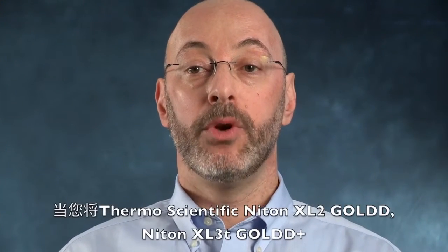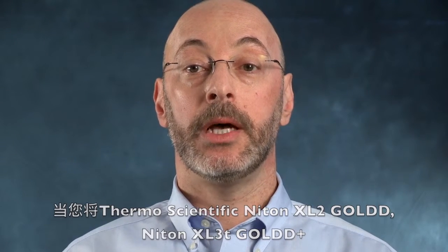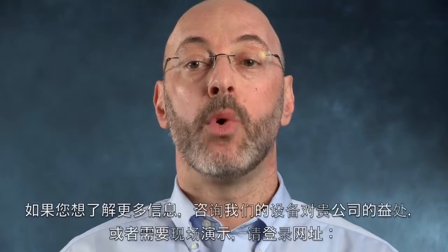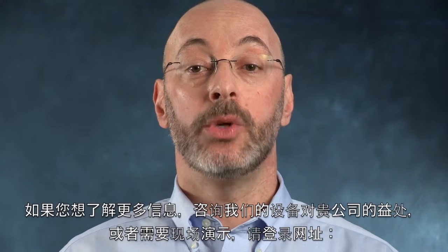When you combine the high throughput of our Thermo Scientific Niton XL2 Gold, Niton XL3T Gold Plus, and Niton FXL instruments with the benefits of our sample prep tools, you too can change the way you work. Whether you want more information, have questions about how our equipment can help benefit your company, or would like to schedule an on-site demonstration, please visit ThermoScientific.com/Niton.